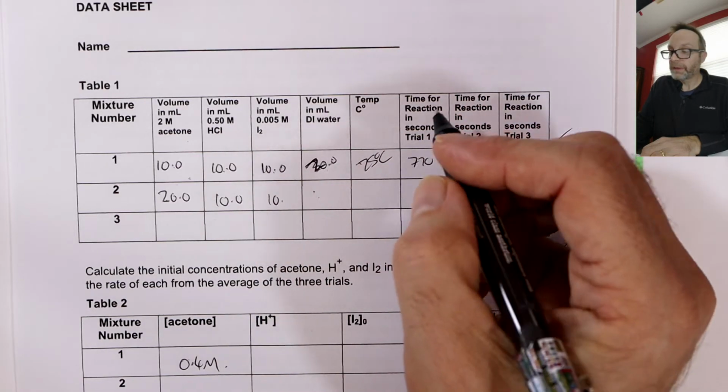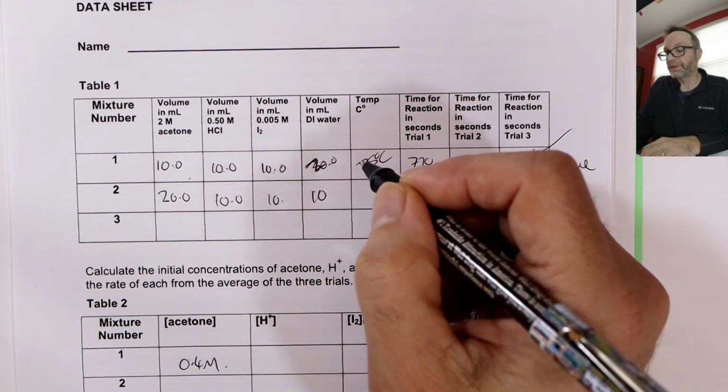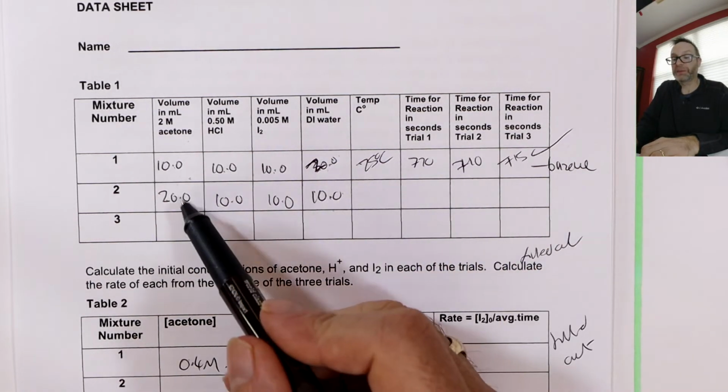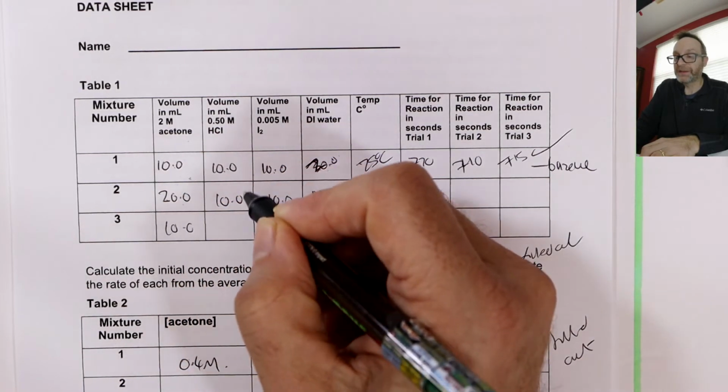Looks like 20, 30, 40, and then 10, 50. Okay, I think that's right. I think it's 50 milliliters. It may be 60, right? So these might be 10 more each time, but either way, we're doubling this one. Okay. And then finally, 10.